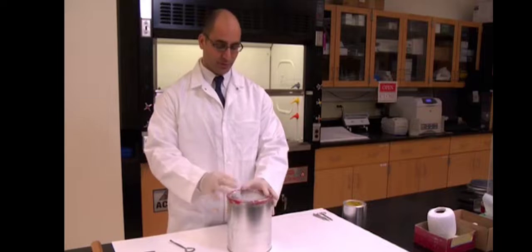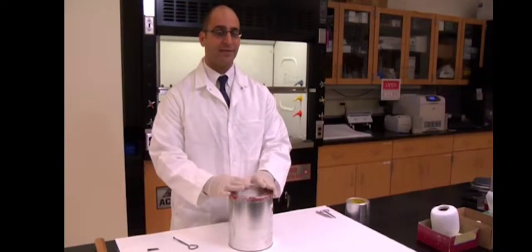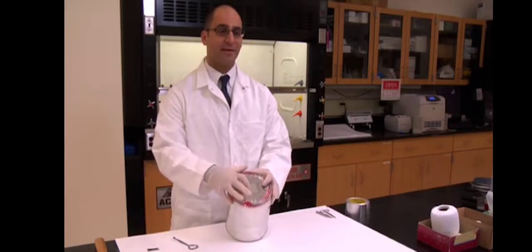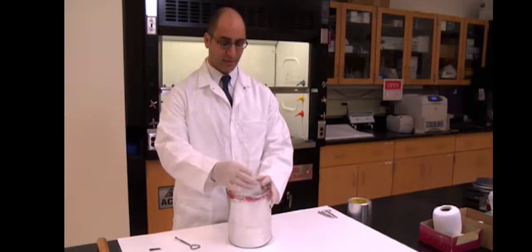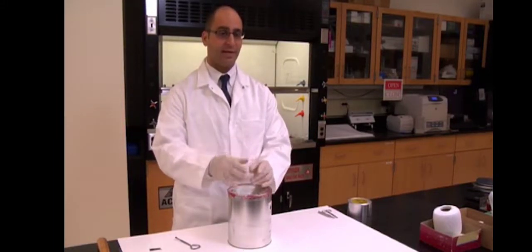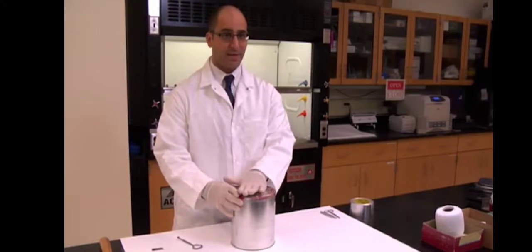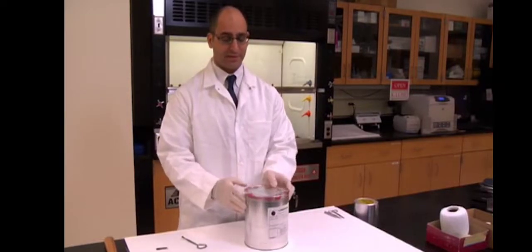In our laboratory, we do two different types of headspace procedures. One is called just plain heated headspace, which is what we did pop the hole in the top of the can for. During this procedure, we would just take a syringe after heating the can, draw off vapor from the top of the can, and then inject it into our instrument for analysis. We would then seal that up and proceed to our second procedure, which is called passive headspace concentration.